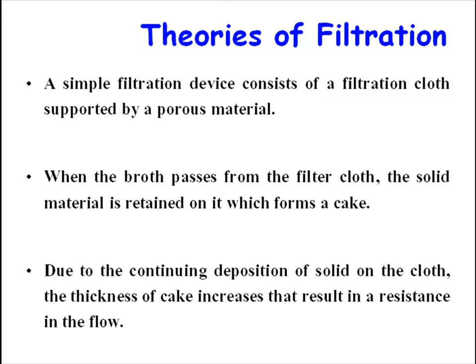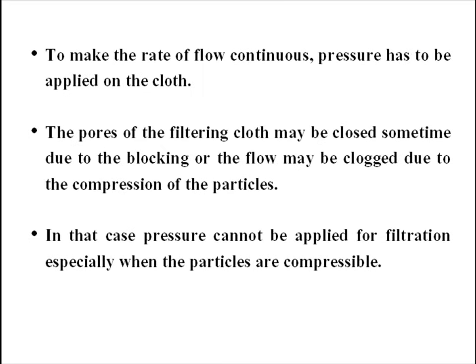A simple filtration device consists of a filtration cloth supported by a porous material. When the broth passes through the filter cloth, the solid material is retained on it, which forms a cake. Due to continuing deposition of solid on the cloth, the thickness of the cake increases, which results in resistance to the flow. To make the rate of flow continuous, pressure has to be applied on the cloth.